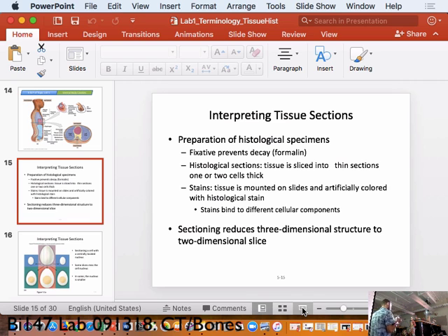Then, when you want to switch to a higher magnification, say you see something that you like, you adjust the stage so that the thing you want to look closer at is right in the middle. Then you take your eyes off the scope. You dial the big knob towards you to lower it. And then you switch to the next highest magnification.